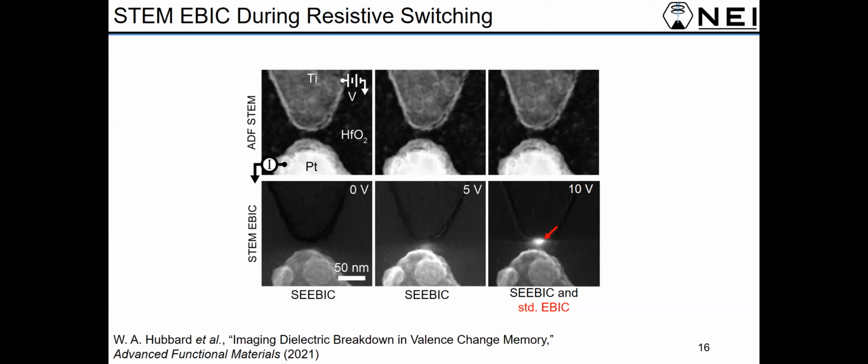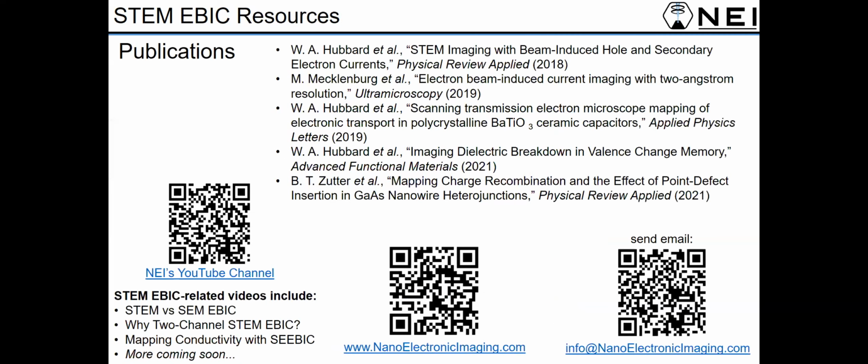So we think this is a very promising capability and applicable to any number of situations where you care about local conductivity changes in electronic devices.